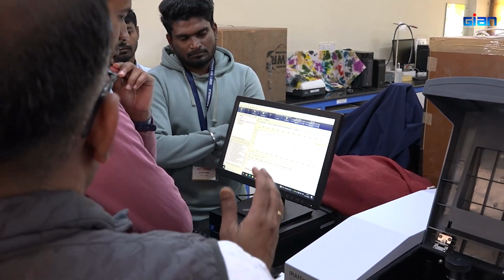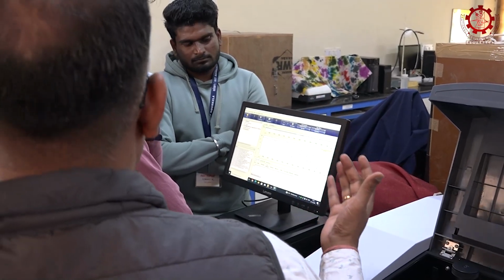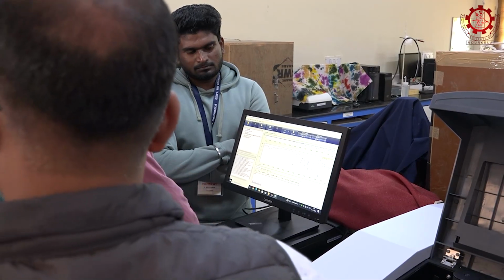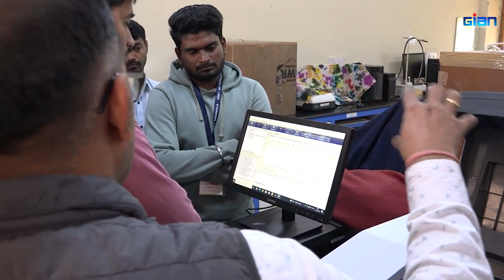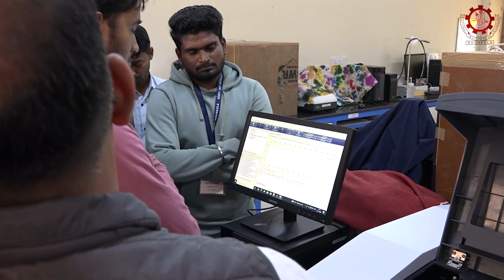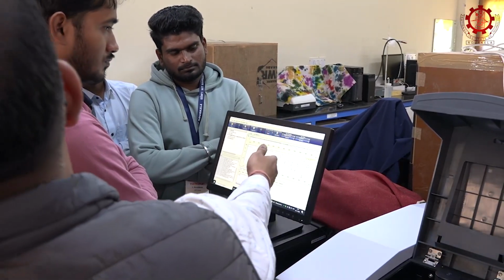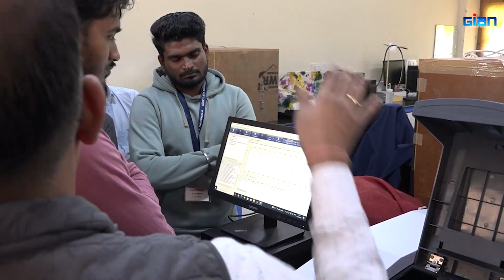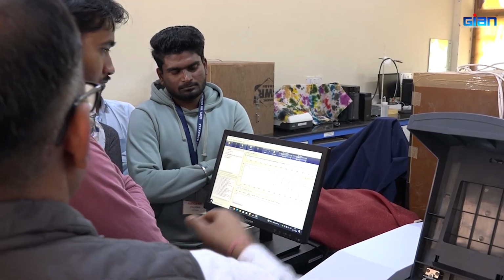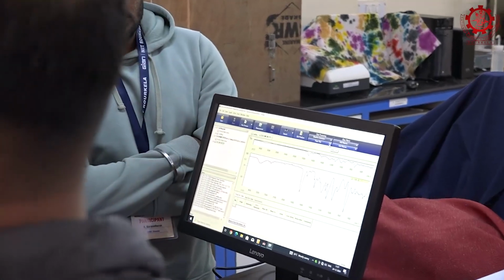So the detector will take the electromagnetic radiation which is not absorbed by the molecule. Now once you have given something and you got something, you know which part of the radiation is absorbed. That will be processed, and that process will come out as a spectrum. That is all the technique used, and then what we will be discussing is how we analyze, because all these peaks have some meaning.